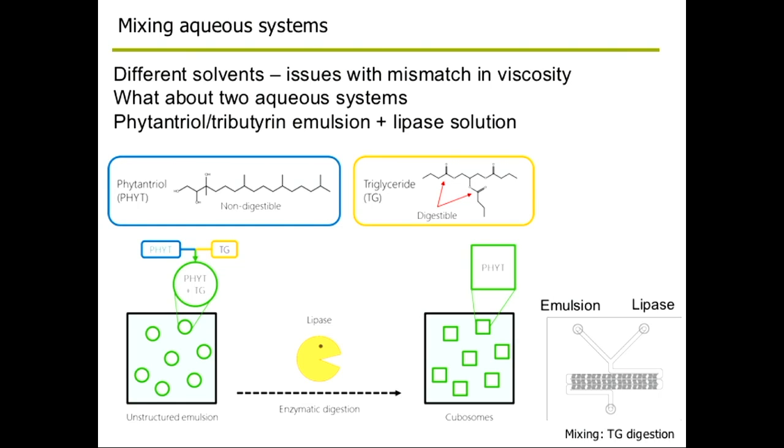So I thought, at least in the first instance with our digestion studies, let's take this system that we had already shown works in a bulk mixing vessel and see if we can get that to mix in a microfluidic environment. We've already seen on the previous slide with the fluorescence data that we have trouble getting complete mixing in these systems at the flow rates that Linda's interested in for this application. We have to run pretty slow with this.